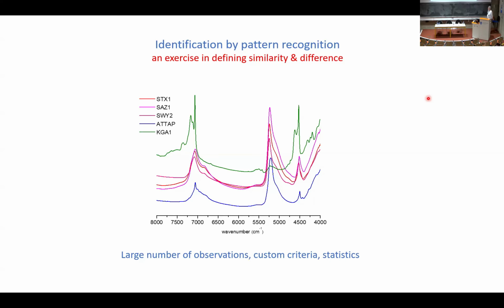Now, the three reddish ones are the three montmorillonite-rich samples from the CMS depository: Texas, Arizona, and Wyoming. The green is KGA1 kaolinite from Georgia. You see it's sufficiently different than the others. For example, you can see that there is very little in this region in the green spectrum. And the blue, that looks like a sharp version of the red ones, is a palygorskite, or an attapulgite, as they call it. This is the palygorskite from Florida, again from the CMS depository.